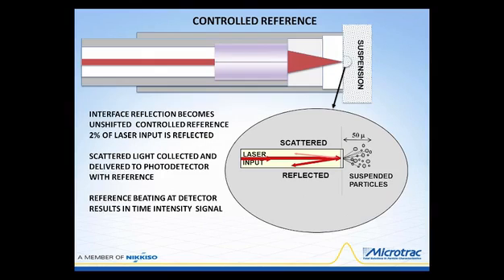The focal point is at the interface, provides the introduction of the laser beam into the suspension, and is the point where the scattered light is collected and sent back into the fiber. This is 180-degree scattering, and the return light is in the same direction, but 180 degrees out from the delivered light.